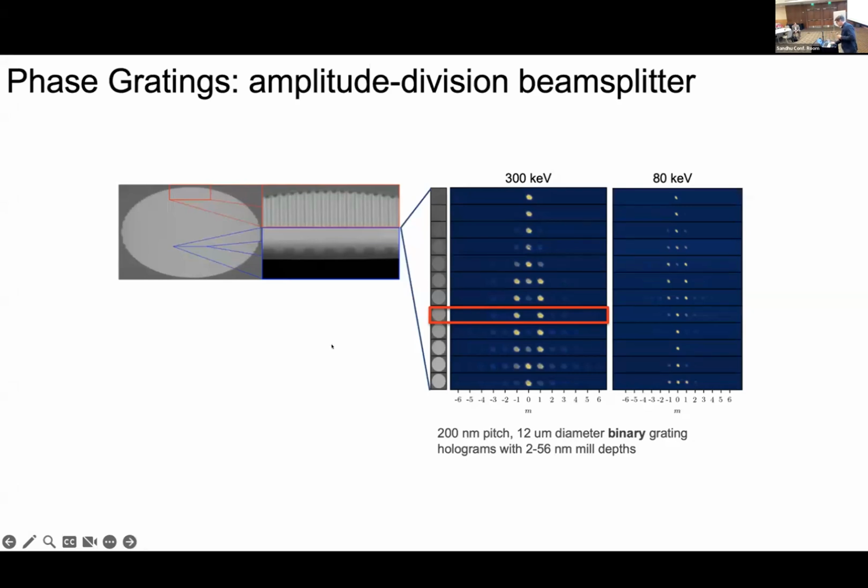Now, that said, these are fairly transparent, but they're not absolutely transparent. We actually do scatter electrons inside the membrane, and those typically hit the liner of the microscope, but it does remove them, and that will become a problem for us later on.